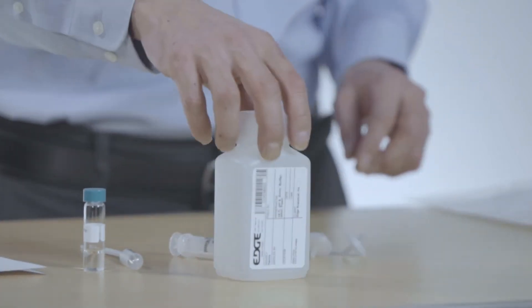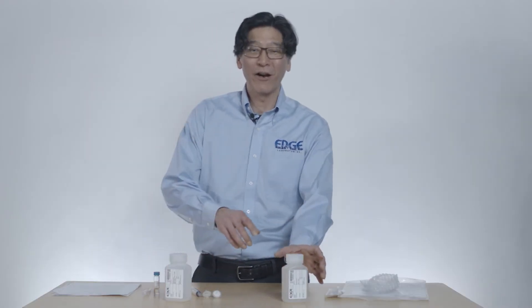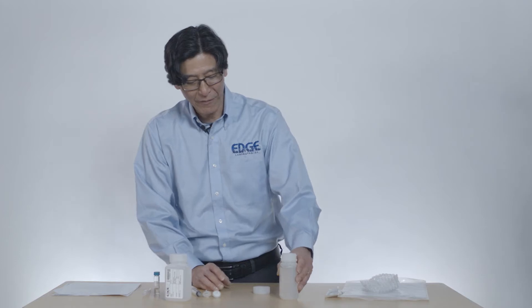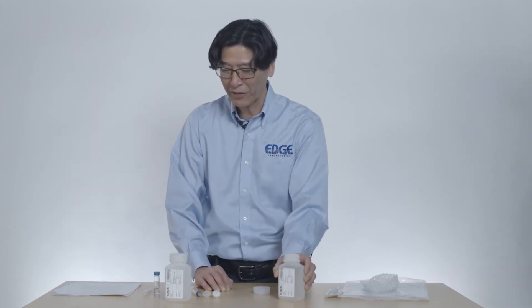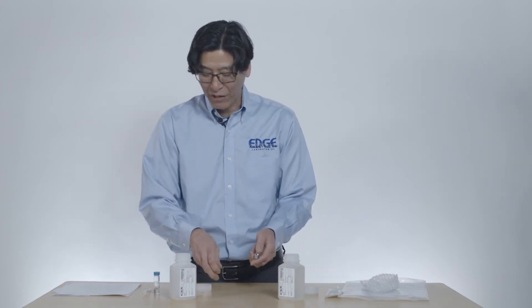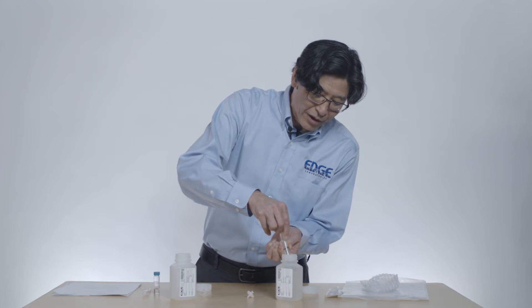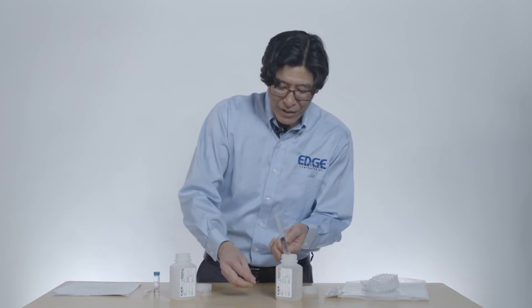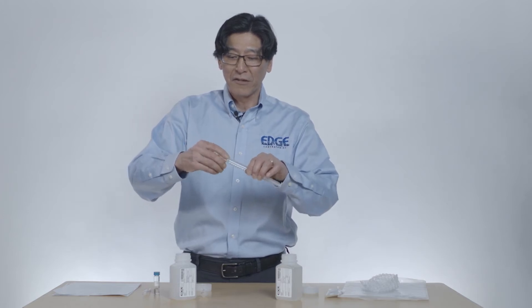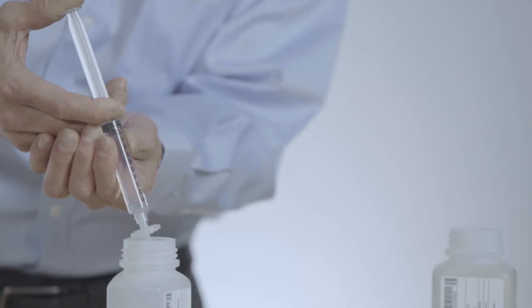We've got our grab sample of unfiltered water and we're going to start filtering. As you know, you're sampling waste waters and things like that, so there can be quite a bit of sediment. First thing we're going to do is take this little syringe, fill it up with liquid as far as we can go, and then attach this — it's called a luer lock. It just screws gently into the filter and into the syringe, and then we push it through.